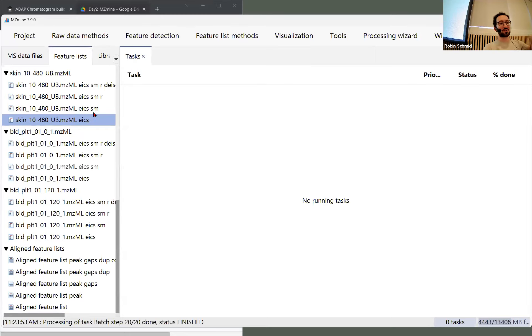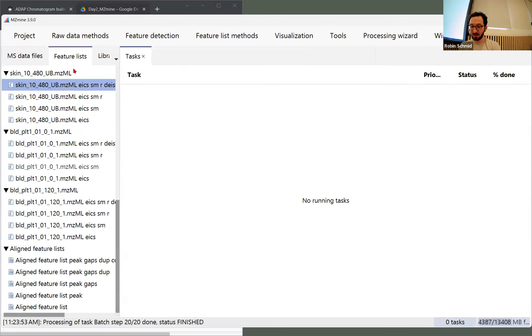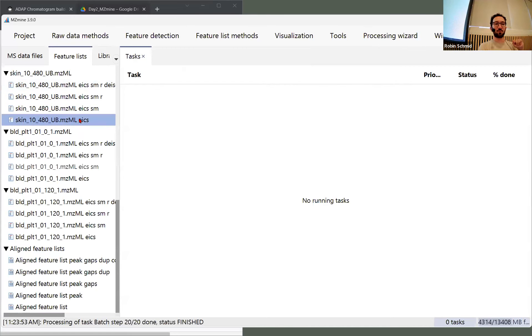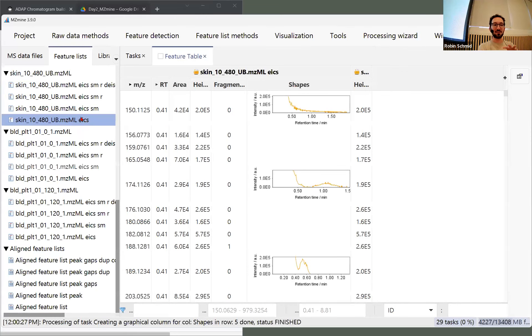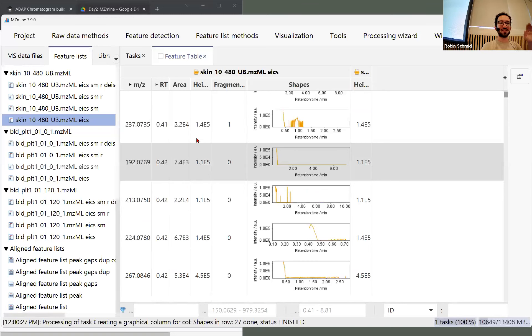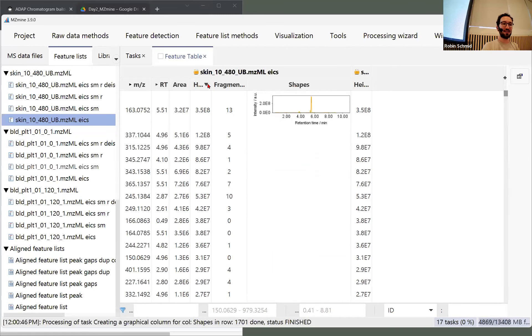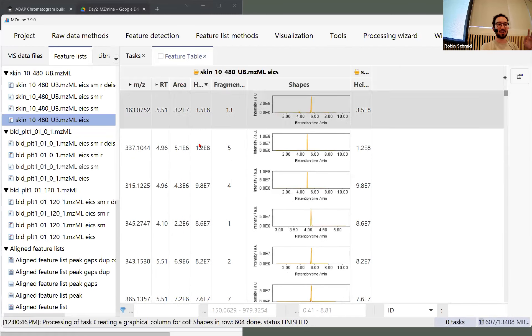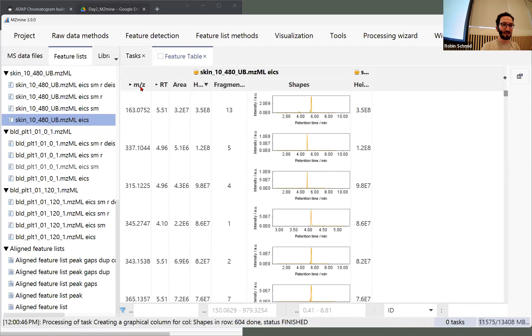...now has extracted ion chromatograms at the bottom, and then the newer set of lists one above the other. We did multiple different processing steps to extract features and you can see the newest one on top. If we double-click on any of those — I selected the EICs here — you can see the feature list opening. It always starts with the lowest retention time, so it's usually some bad feature shapes or bad chromatograms.